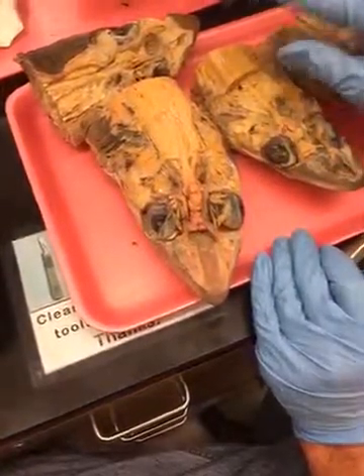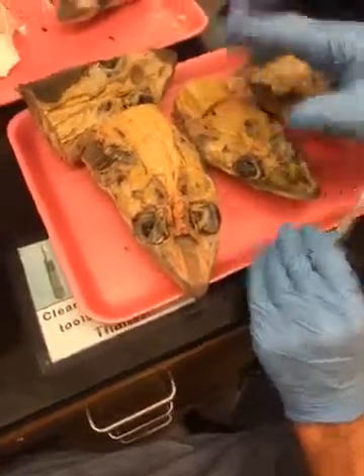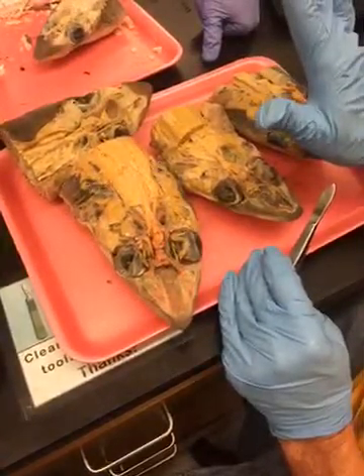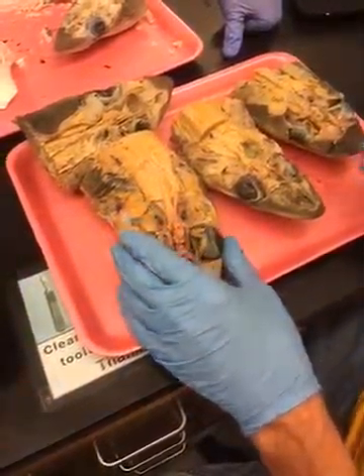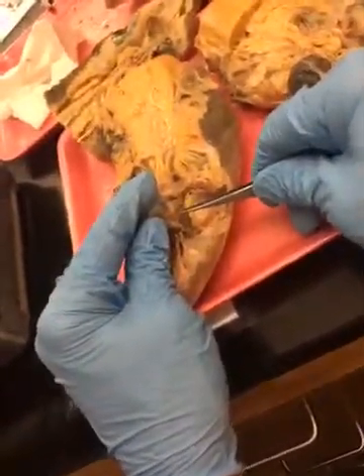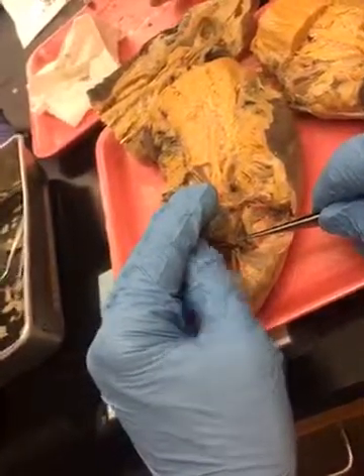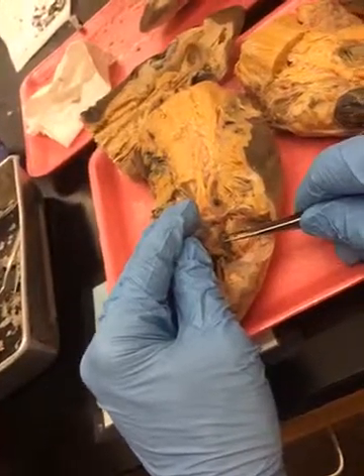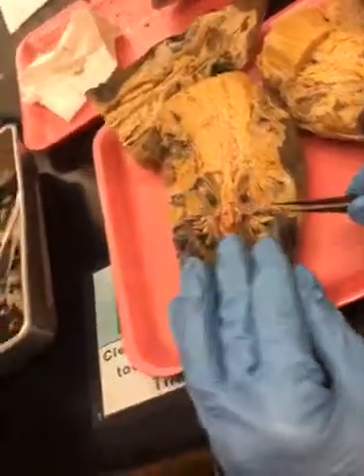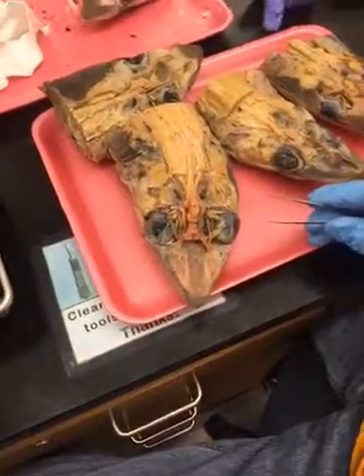Nerves 3, 4, and 6 innervate the eye muscles. Nerve 3, the oculomotor, that's easy, oculo-eye motor. The oculomotor goes to four of the eye muscles. You only have to see the most obvious branch, and that is the branch of the oculomotor right here on the ventral surface of the eye, that right there, that is running to this ventral oblique. So that's the ventral oblique muscle, and there's the branch of the oculomotor that runs to it. Other branches run to this ventral rectus, dorsal rectus, and medial rectus, but you don't have to find them. So that's nerve 3, oculomotor.